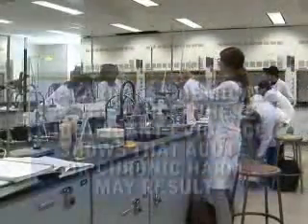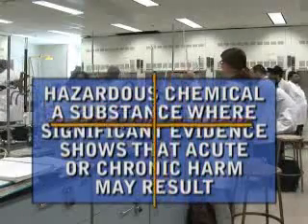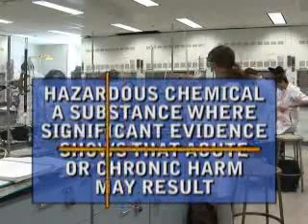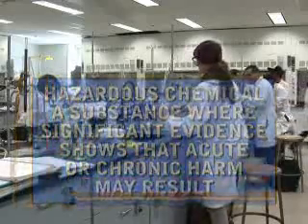OSHA defines a hazardous chemical as a substance for which there is statistically significant evidence based on at least one scientific study showing that acute or chronic harm may result from exposure to that chemical.